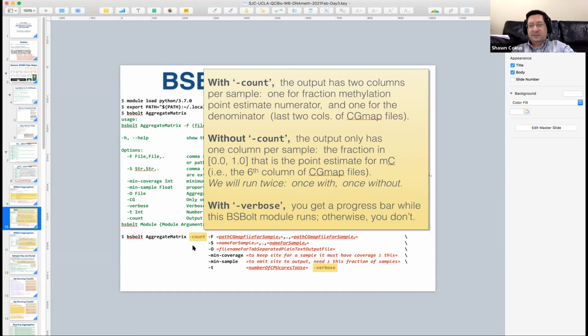It would have made more sense to me to just put 3 columns and have the same data in there. Really, the methylation fraction column isn't that terribly useful, because you almost always need to know the integer numerator and denominator, and it's so trivial to recompute the fraction that it's like, why bother with all this complication with this extra column? But such as it is, part of it has to do with interoperating with software that already took files of this kind of format from before. History, inertia, is always a powerful motivator.